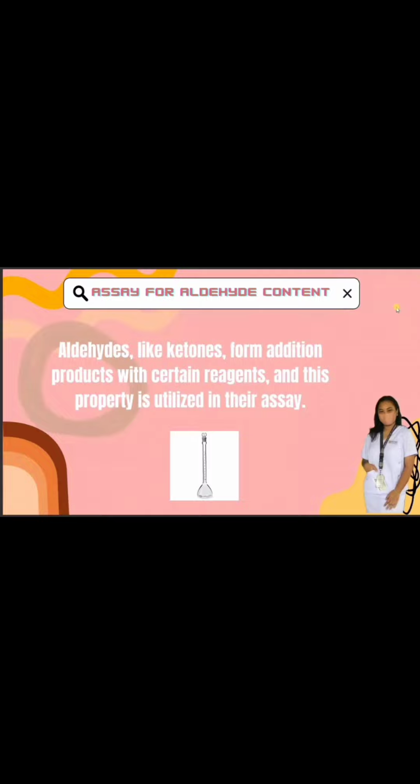In the assay of aldehydes and ketones by the bisulfite method, the portion of the oil that does not react to form a water-soluble addition product rises to the surface, and when the flask is filled, this oil layer rises into the graduated neck of the Cassia flask, where its volume can be measured. The volume of residual oily layer subtracted from the volume of the sample oil used represents the volume of the aldehyde constituents that formed a water-soluble addition product with the bisulfite.